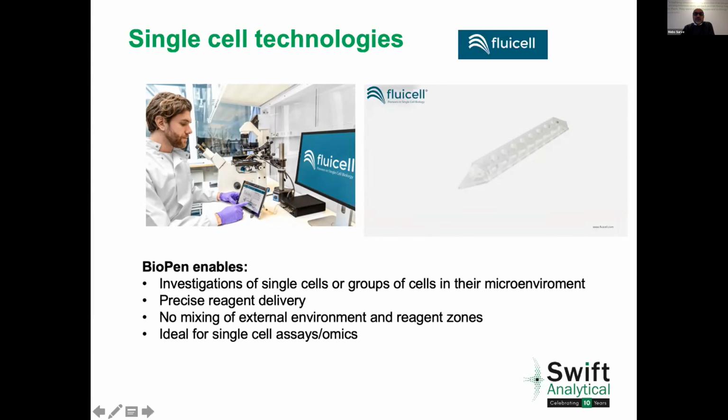On the left, you can see the device, which comprises a control box, which controls the pneumatics. We also have a pen holder and an Android-based tablet in order to operate the microfluidics. On the right-hand side, we've got a video which I'll quickly scroll through.